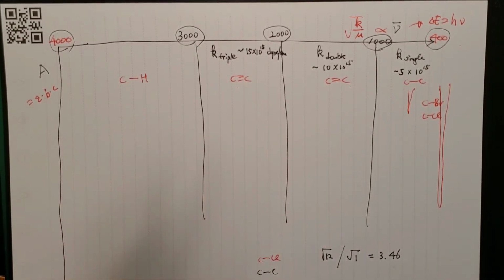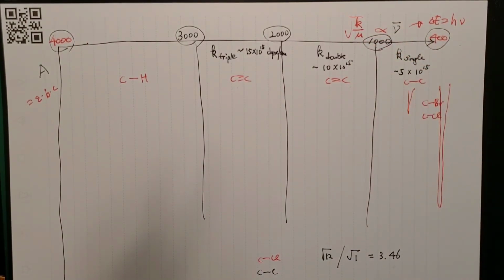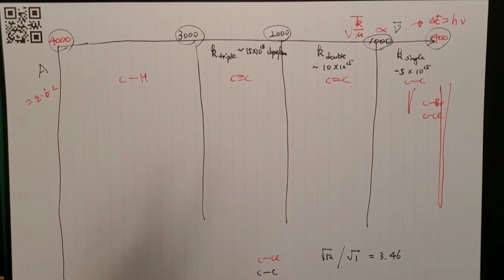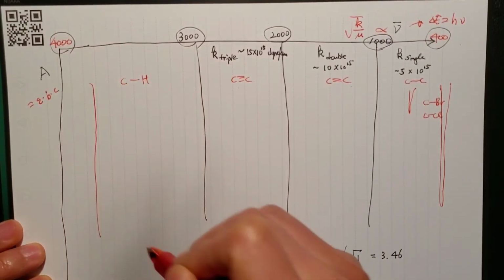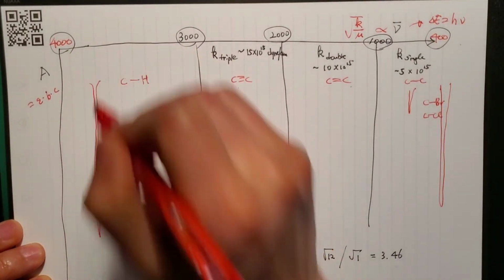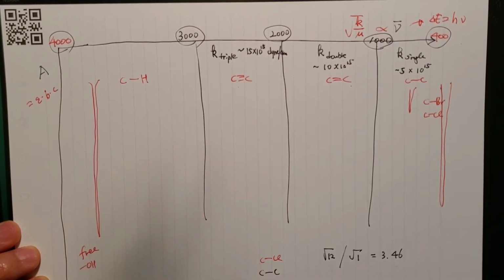If you have a hydrogen, whether you have a carbon, oxygen, or nitrogen, the difference is small because, if you take a root of the reduced mass, carbon, nitrogen, and oxygen are not that different. They're all coming in this first box. But what's different is OH, it could come in here very strong and sharp if they're not hydrogen bonded, free OHs.